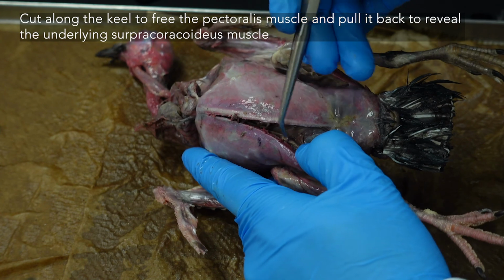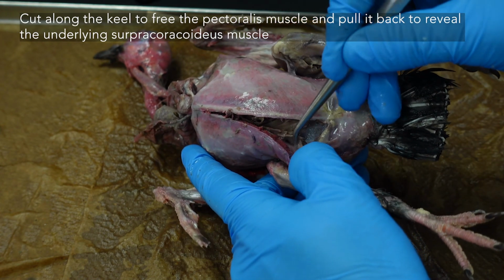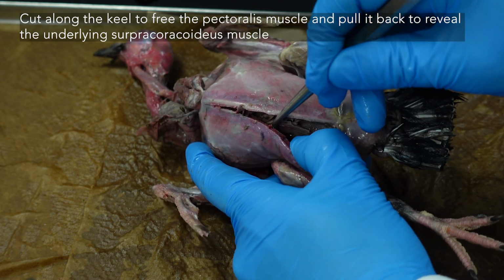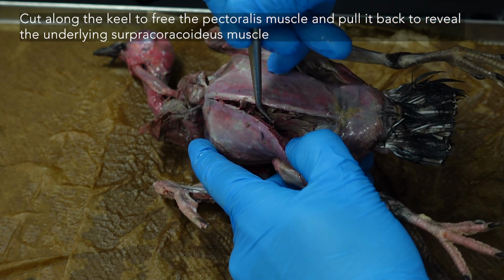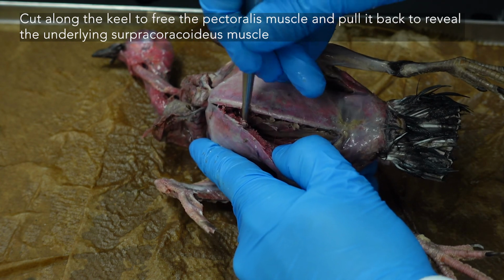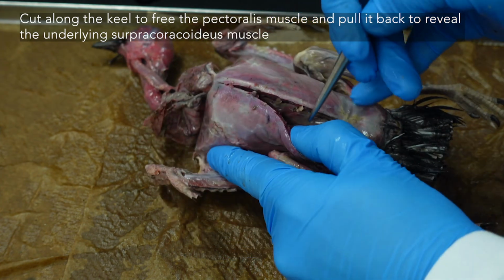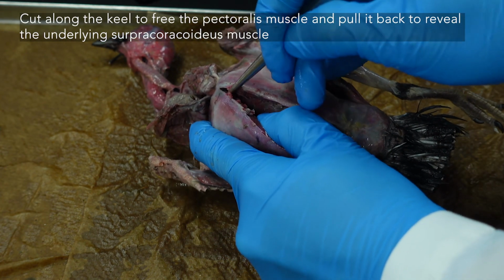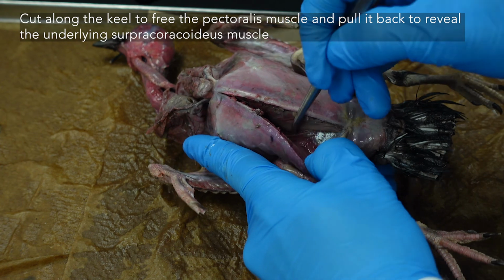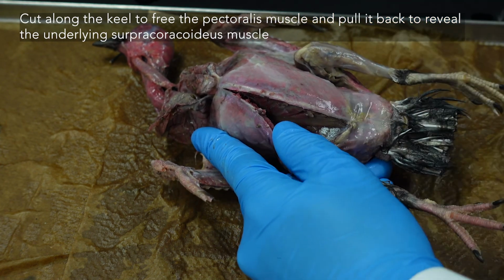So I've freed the pectoralis muscle from the keel, and as we peel up, you're going to want to look. Also cut down into the supracoracoideus a little bit. But that's okay. So look for that muscle separation. And that's how you're going to separate your pectoralis from supracoracoideus.